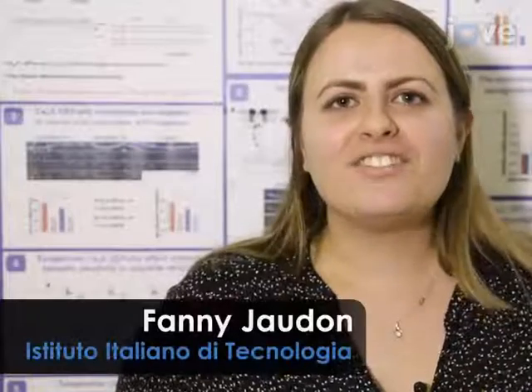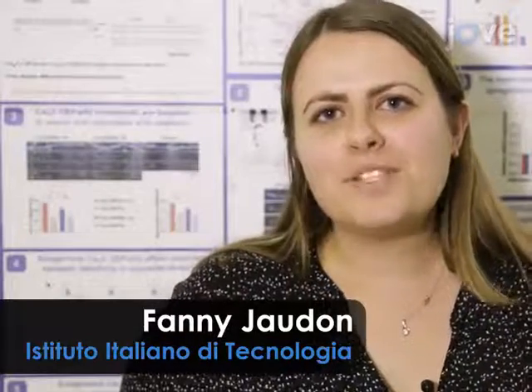The main advantage of this technique is that it makes it possible to monitor synaptic transmission selectively at neurons with reduced expression of the presynaptic protein under investigation. Although we have used this method to investigate presynaptic function in acute brain slices, it can also be applied to manipulate and probe neuronal circuits in vivo. Demonstrating the procedure will be Carmela Vitale, a grad student from our laboratory.